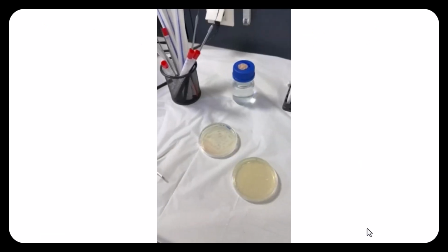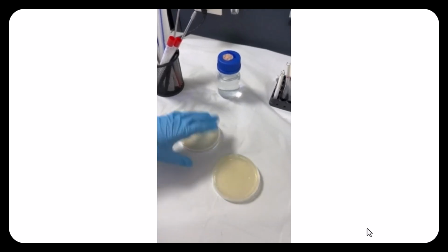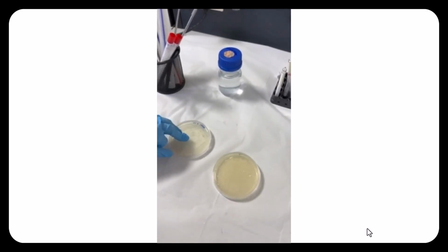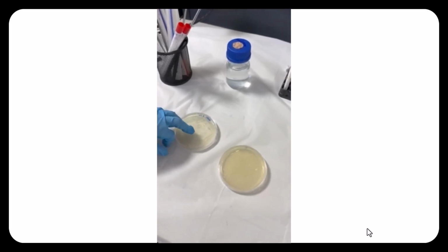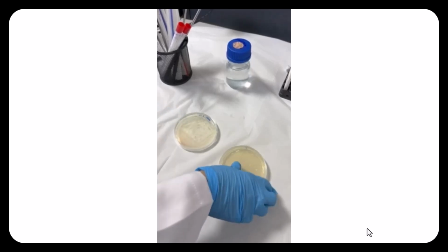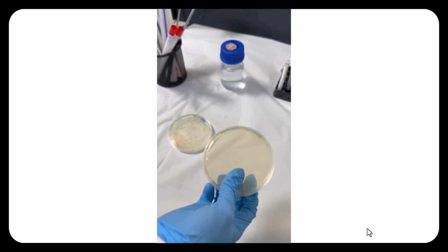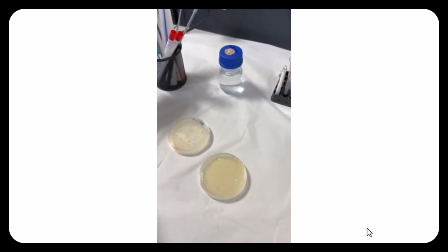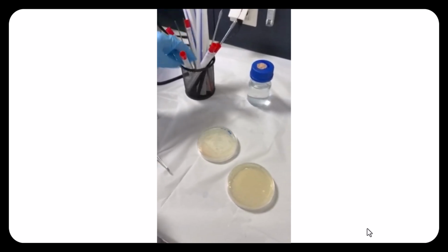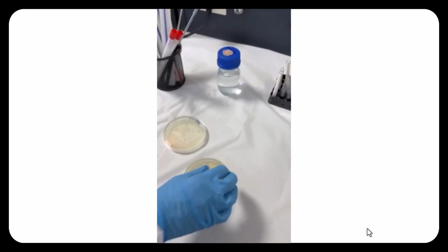Now the procedure of the antibiotic sensitivity test. We do this test after the correct identification of the microorganism, the species of the bacteria. We should have a pure colony of bacteria, a fresh culture. We have the special media, which is called Muller-Hinton agar, special for this test. Antibiotic discs according to the type of the bacteria, sterile swab, sterile loop, and sterile forceps.